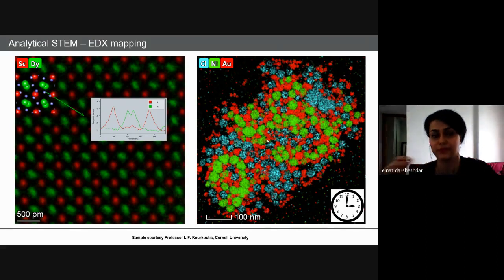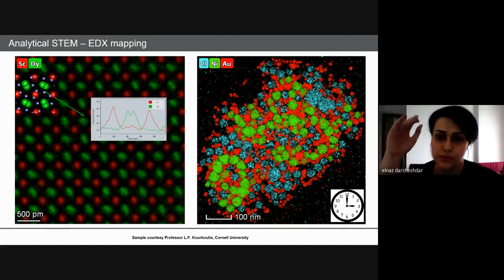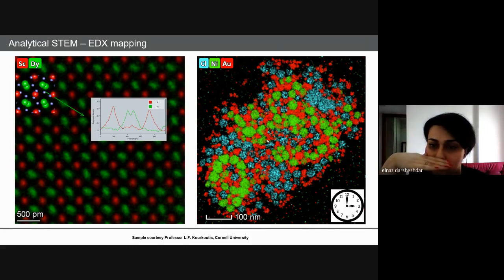If you want to count particle size, for instance, if you are working with catalysts or metals and you want to see grain boundaries, TEM is faster to use and it's going to give you a good overview. But sometimes you're going to have some artifacts in the imaging due to diffraction. There are some grains that are going to light up because they are diffracting heavily, so there are grains that are going to be bright and others dark, and they are going to be the same material.